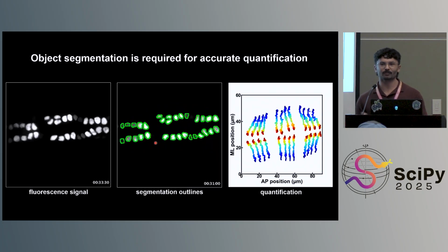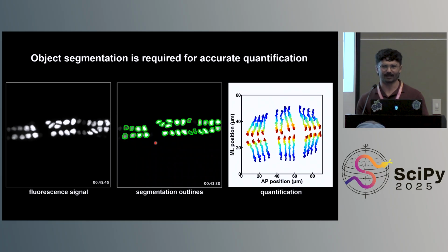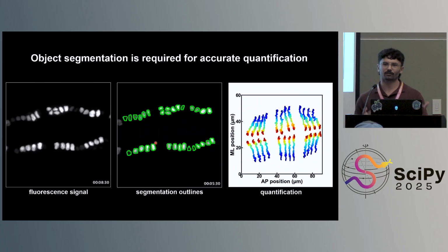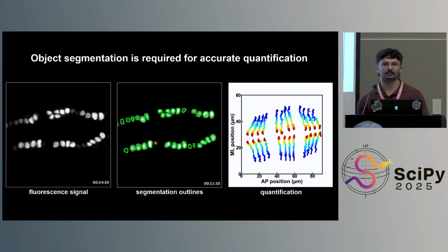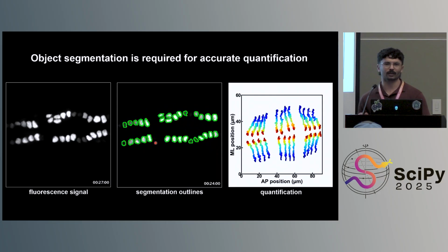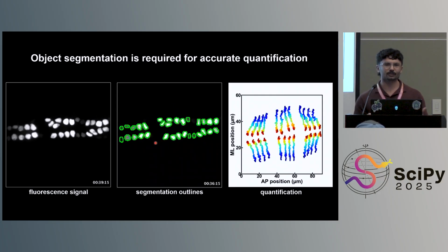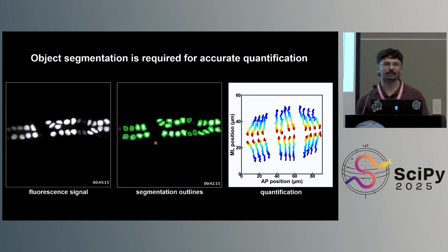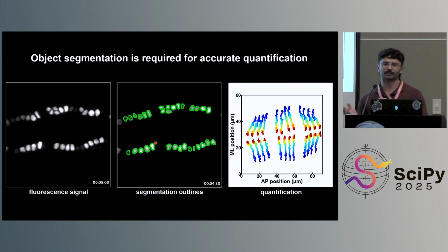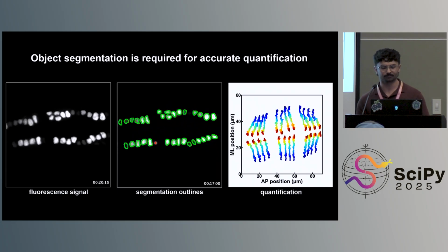For a full experiment of 15 videos, you're looking at about 100,000 circles that you have to draw by hand. And so obviously, we want to be able to automate this process. There exist many image processing algorithms that attempt to do so, such as the watershed algorithm. However, often these algorithms don't extend well to new data, and they're inaccurate. This is a big issue for performing research because we really need there to be very high levels of accuracy. Any errors that are made, we can't just leave, we have to go back and correct, because then we could be publishing erroneous results.